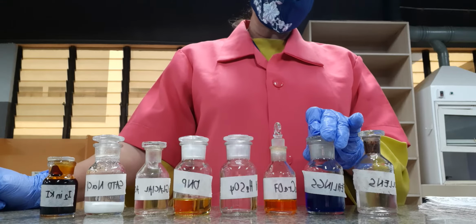These two reagents will not give a positive reaction with ketones. Once again, our Tollens test is a test for the reducing property of aldehydes, just like aliphatic or aromatic aldehydes.